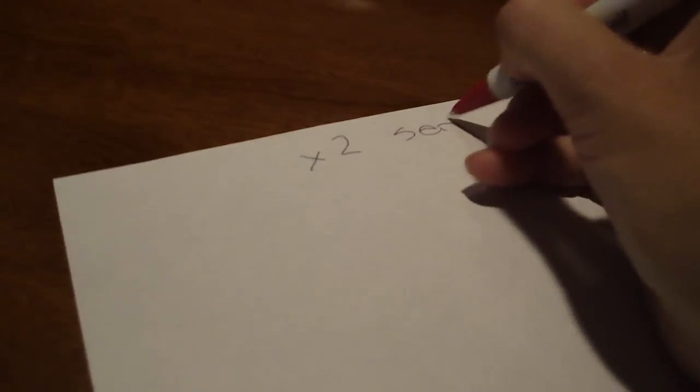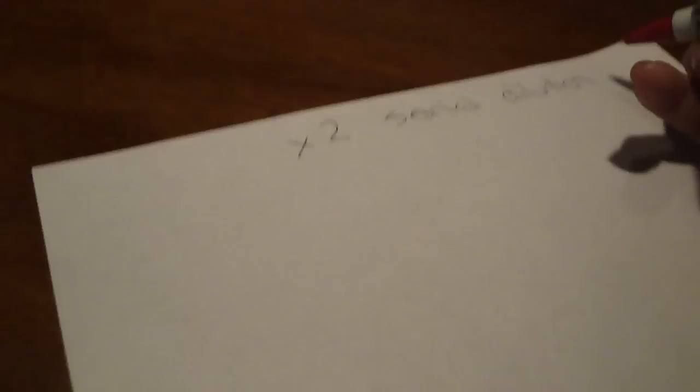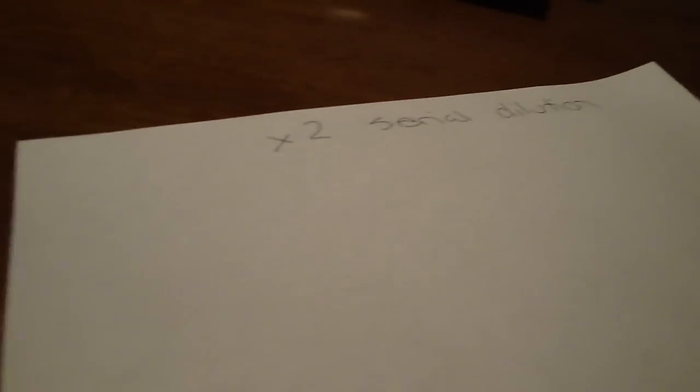So we will start with a times two serial dilution. It's very important that when you're doing dilutions on a test, go ahead and make up your tubes on the paper. It makes it so much simpler. You don't want to get too caught up in what your final dilution is. Do one step at a time.